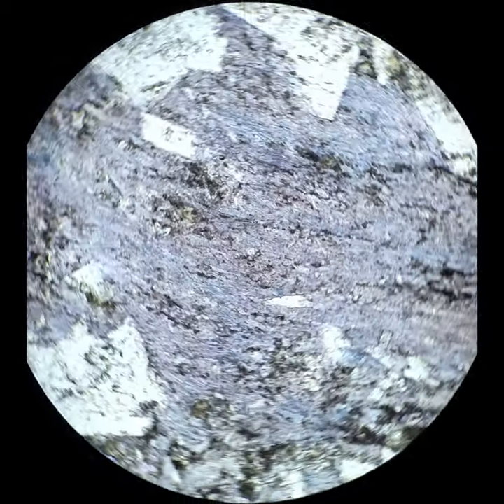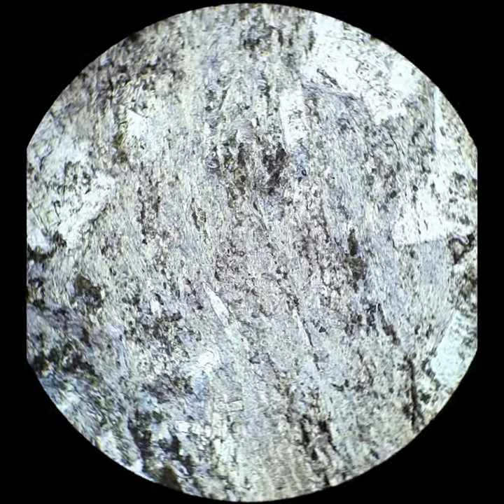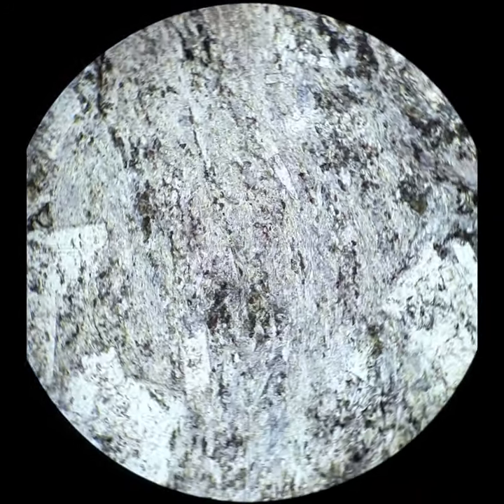Pleochroism can be one of the few ways that we can identify some minerals. This very fine-grained blue to purple to maybe yellowish-green mineral is almost certainly glaucophane, because that's about the only mineral that has that pleochroism.